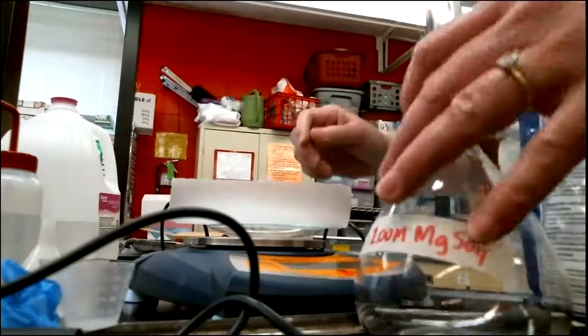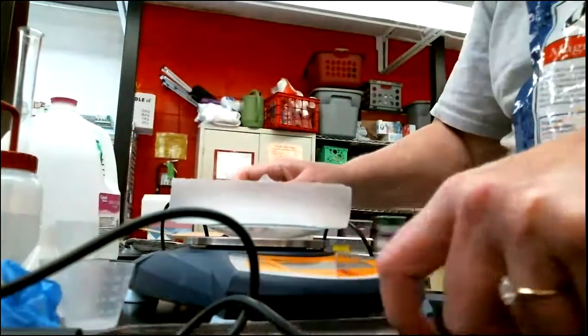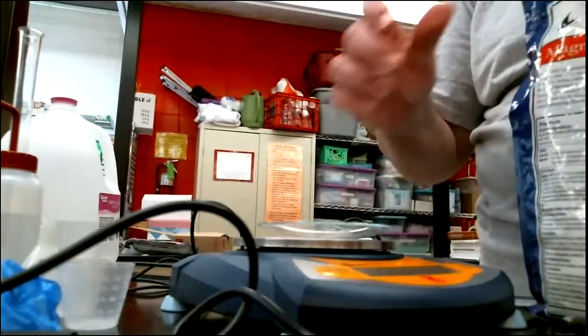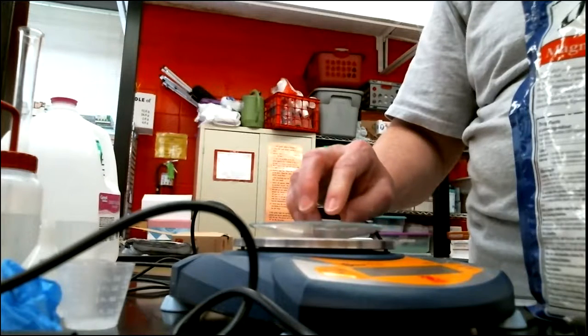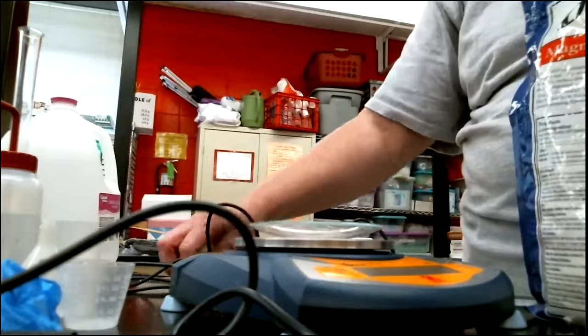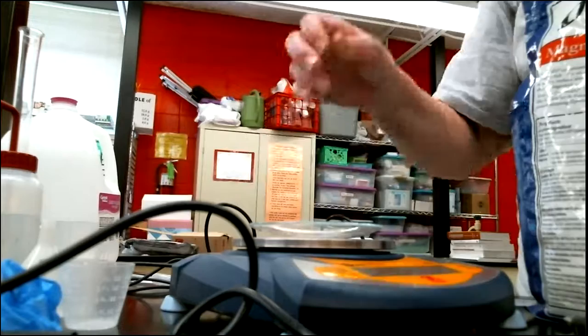Now, I've got a watch glass here, which I'm using to kind of stabilize everything. I'm putting it on the balance. Well, you know, I don't want to measure how much the watch glass weighs. So hopefully you know that you have to zero out the balance once you put stuff like that on there, that you don't want to know the mass of it.